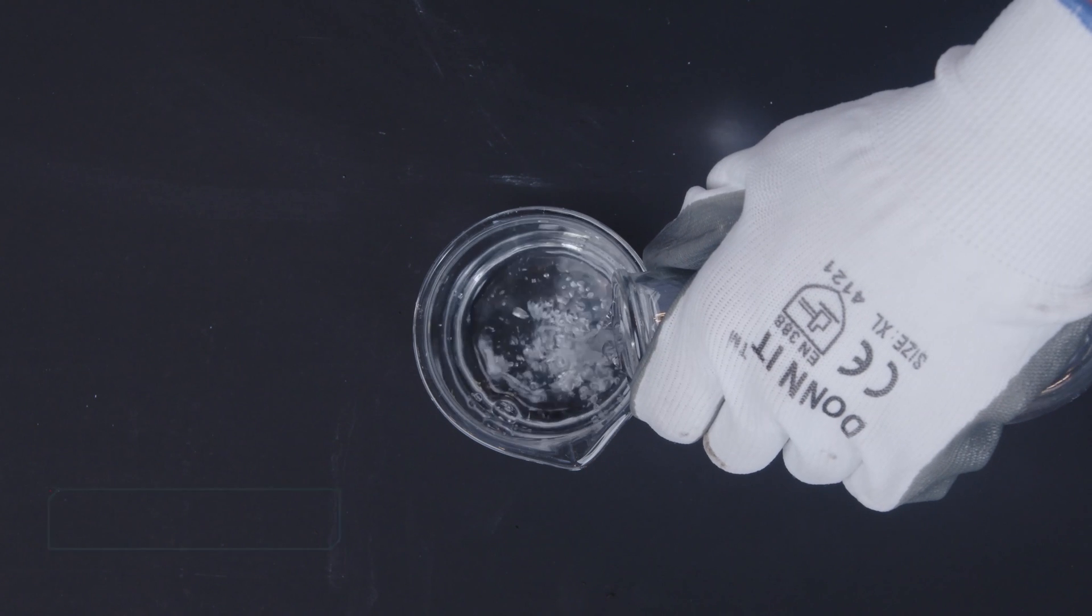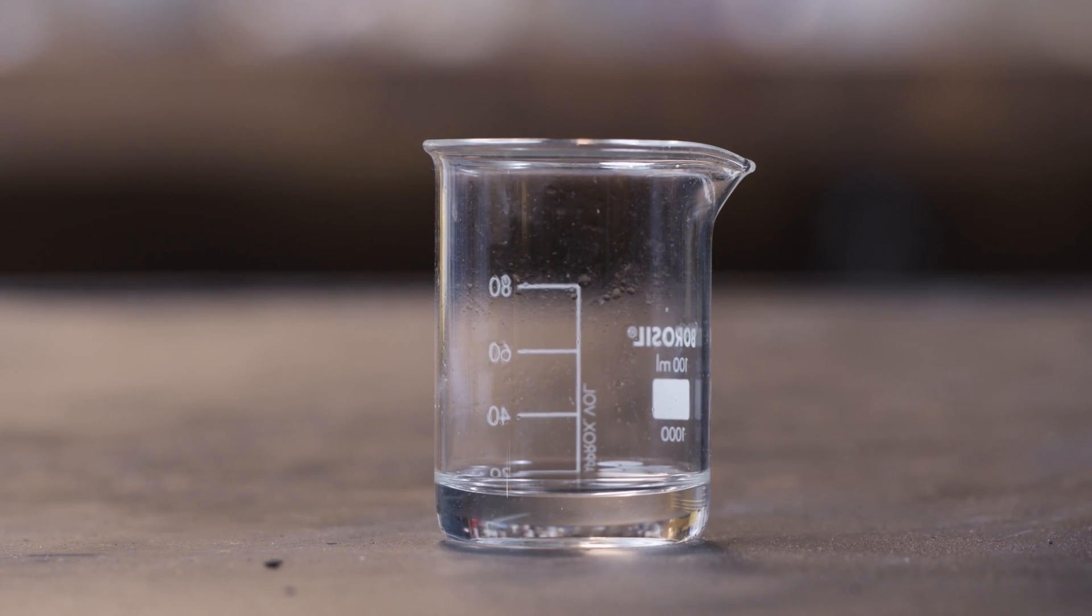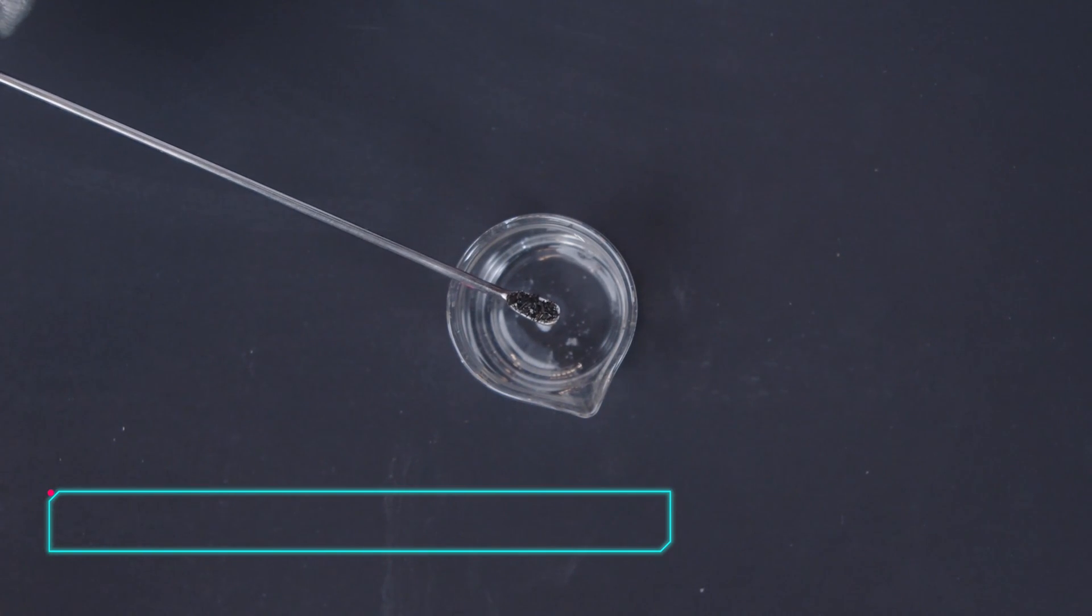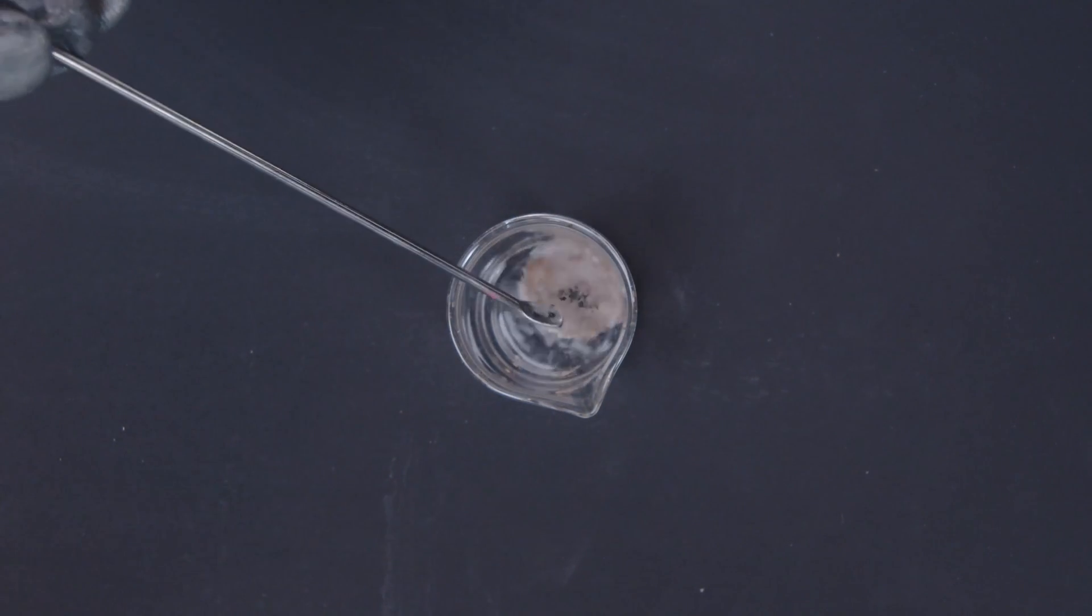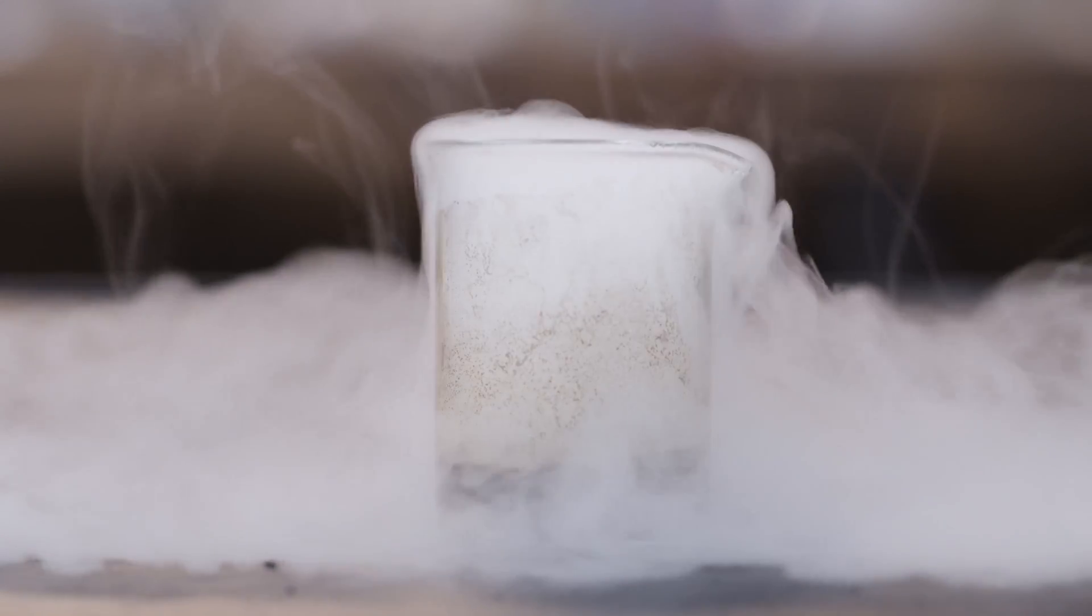Just please make sure you wear gloves because this stuff is extremely corrosive. So with one of those deflagrating spoons, put a few potassium permanganate crystals into the beaker and watch how much vapor rises into the air.